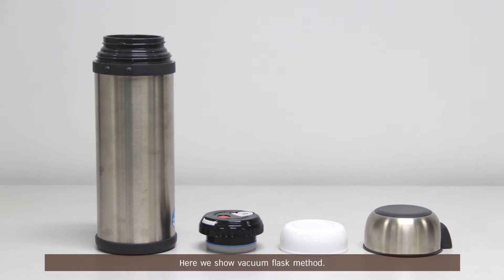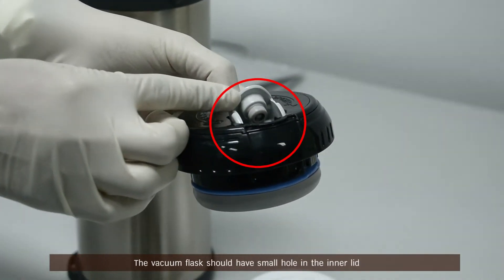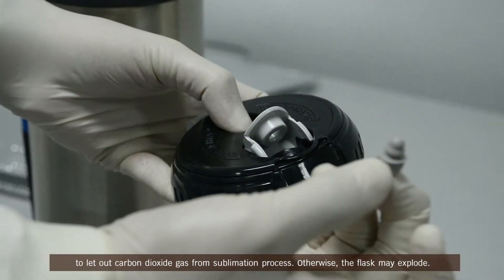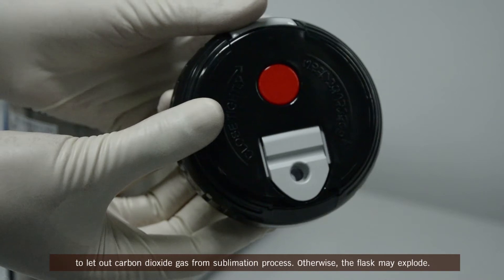Here we show the vacuum flask method. The vacuum flask should have small holes in the inner lid to let out carbon dioxide gas from the sublimation process. Otherwise, the flask may explode.